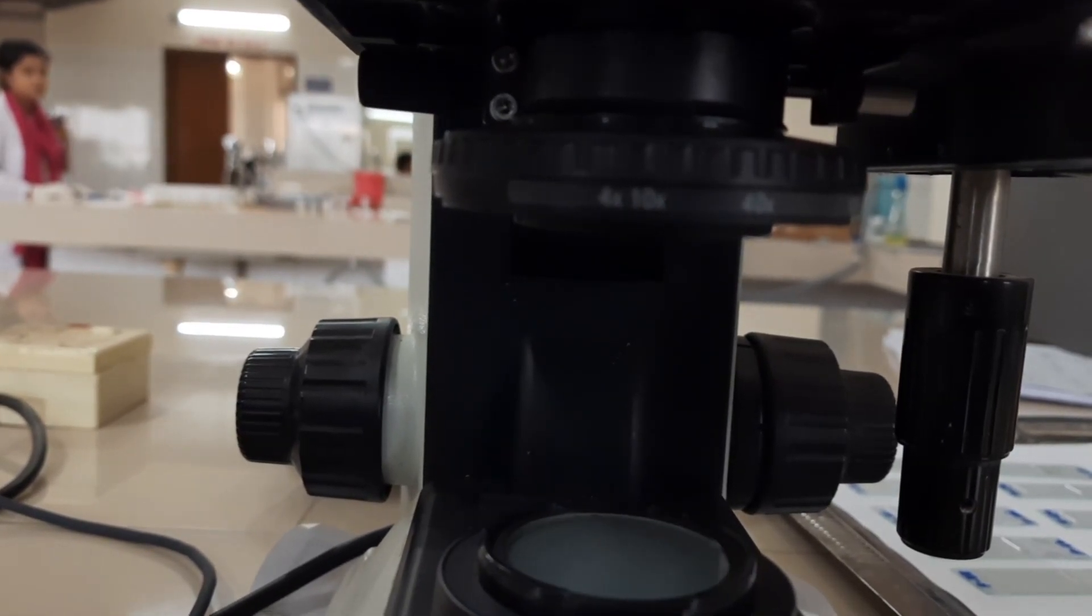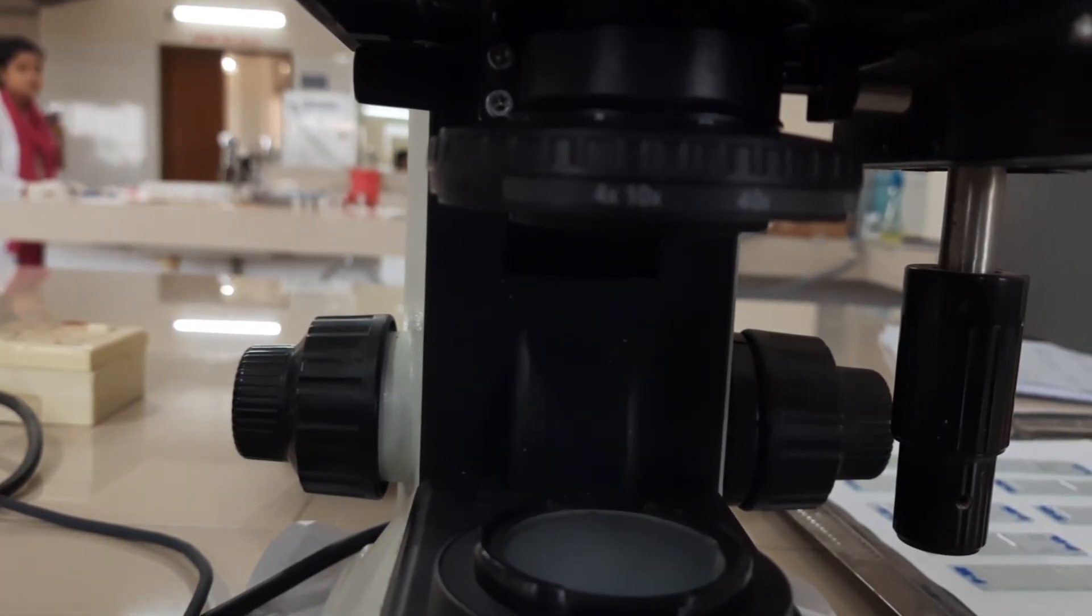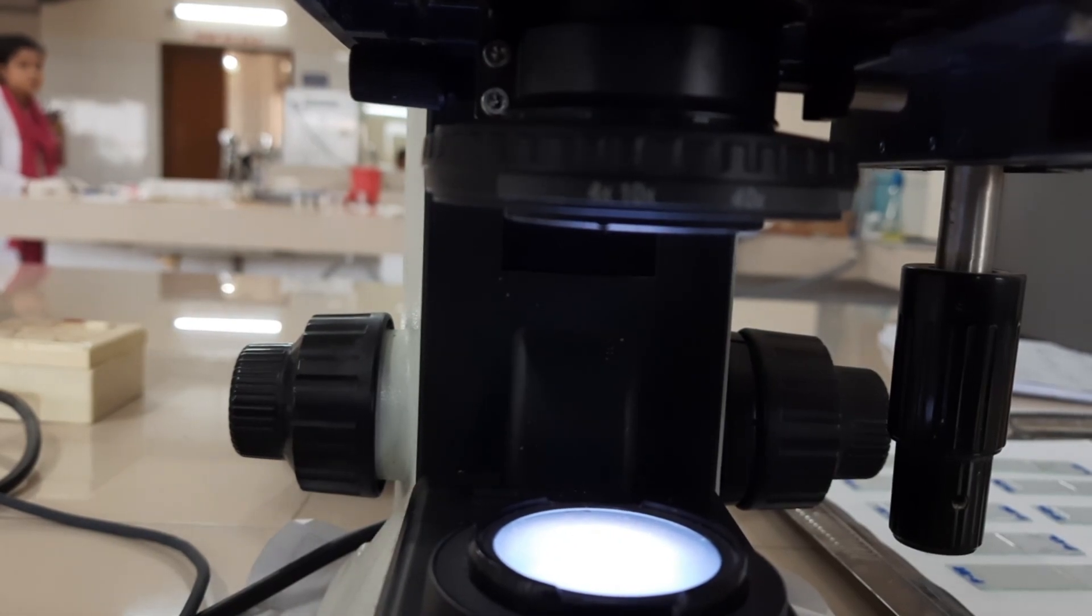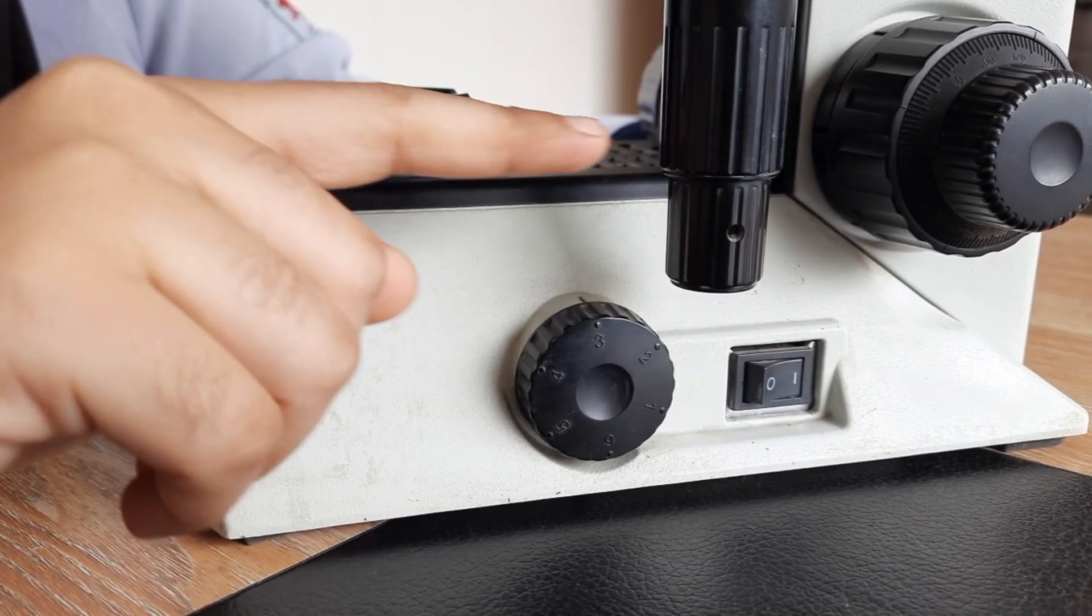A light source, often located in the base of the microscope, provides the necessary illumination for your specimen. It can be adjusted according to your need by a regulator.